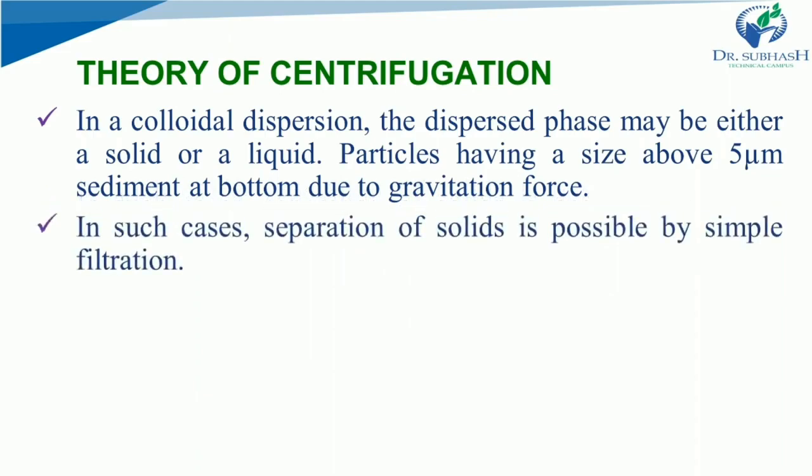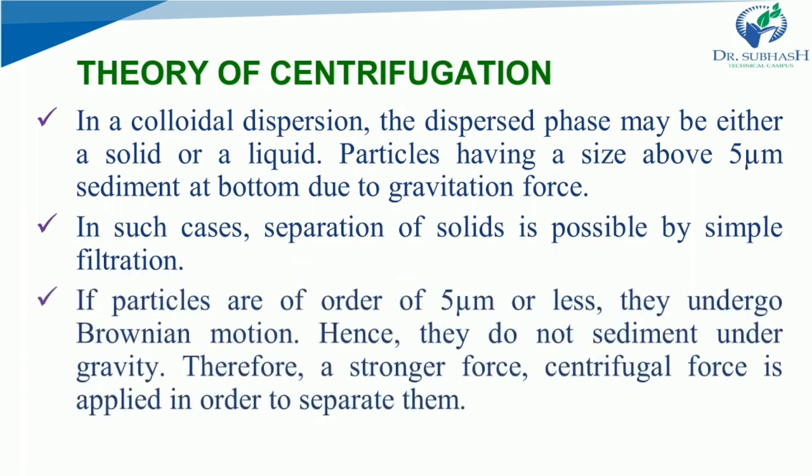In such cases, separation of solid is possible by simple filtration. You can easily separate solid by filtration. If particles are of the order of 5 micrometer or less, they undergo Brownian motion. If they are less than 5 micrometer, they will undergo Brownian motion, and hence they will not sediment under gravitational force. Therefore, a strong force, that is centrifugal force, is applied in order to separate them. About Brownian motion, you will get to know in your coming semesters in the subject physical pharmacy. You will learn it really well, so focus on that topic.